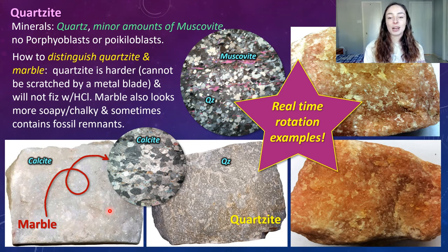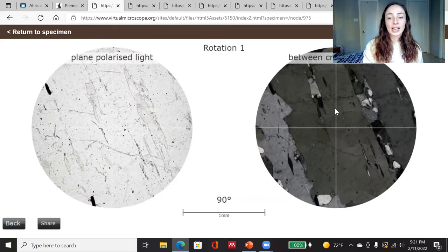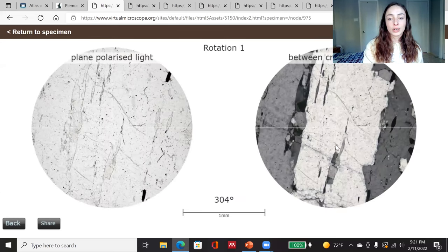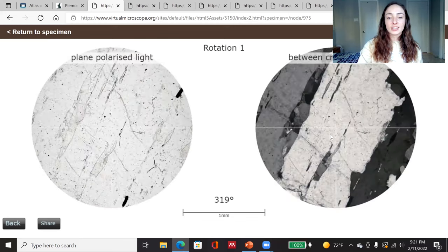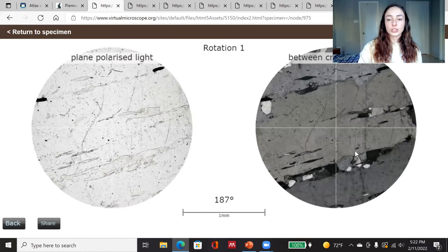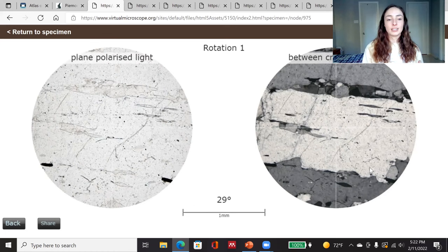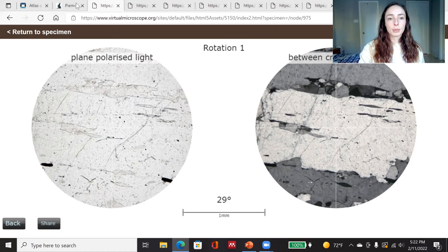Now for some real-time examples where I'll rotate the thin section under the microscope. Here we have an example of quartzite where you can see the black and white flashing of the quartz under cross-polarized light. These grains of quartz are much larger than the previous sample, so they're taking up most of the frame. As we rotate it, you can see them speckle and flash. This sample also has a little bit more of a preferred crystal orientation, meaning it probably underwent higher pressures when it was being metamorphosed.